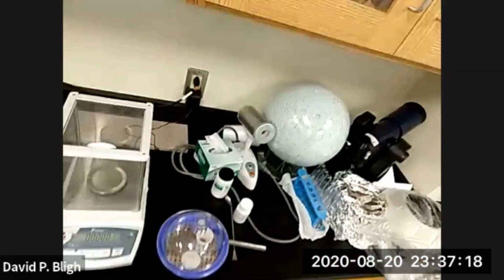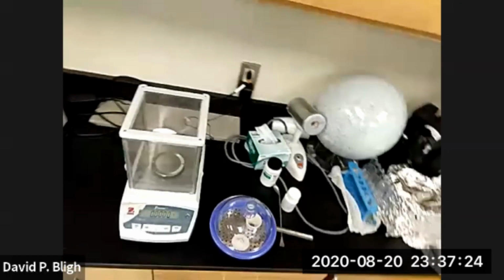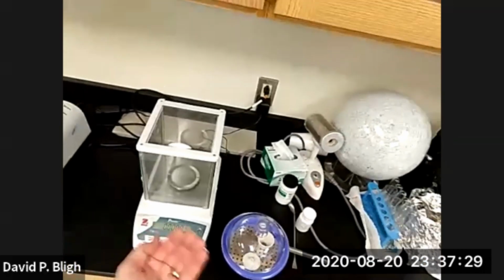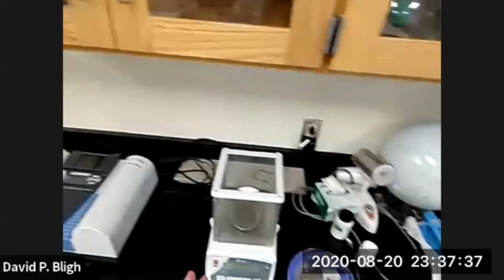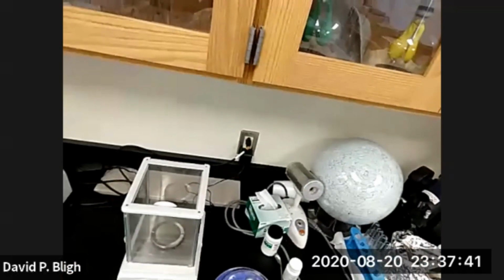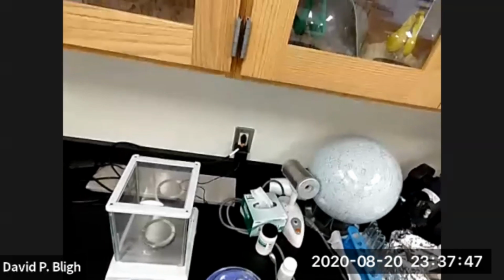You weigh both the crucible and its lid. Why would you want to do that? You really only need the crucible because that's what's holding the material. Well, here's why. When you heat that material on that flame, it might spatter. As water comes out of the material, it may vaporize so quickly that it'll spit and spatter.